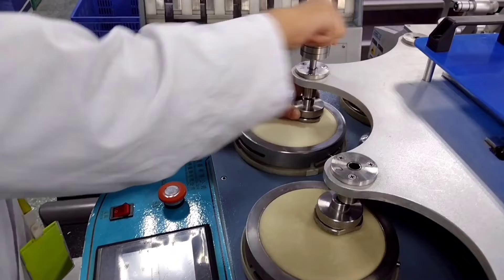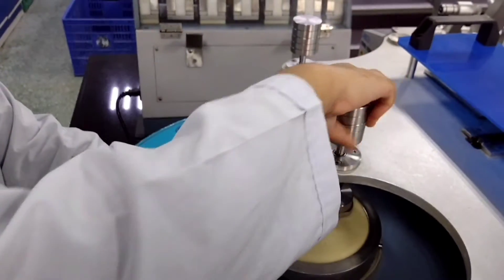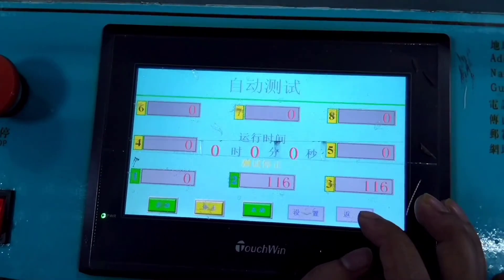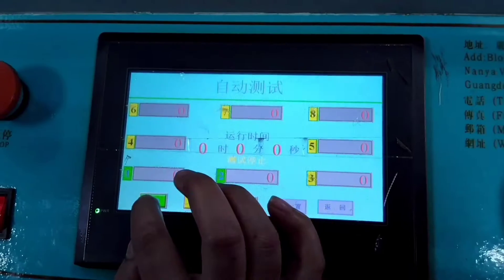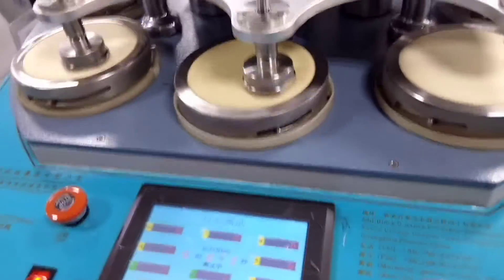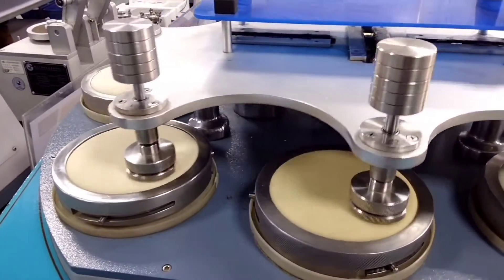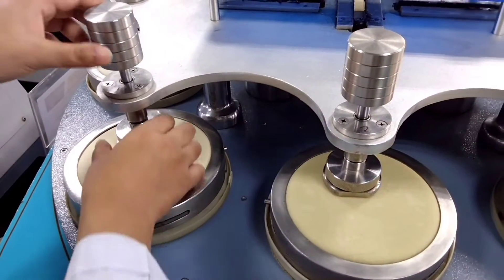Now, I am setting the mass on. Now, I am setting the setup for test. Preset setting 1000. Now, I am setting the test.